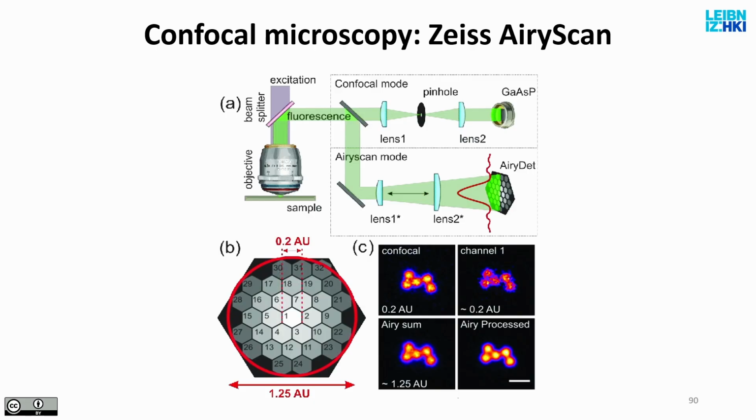In a synchronous experiment, it's one measurement. They are all hooked up in parallel. That's genius, because then I can calculate this curve, extrapolate it to 0 Airy unit, 0 diameter, and I can get the theoretically optimal confocal image.